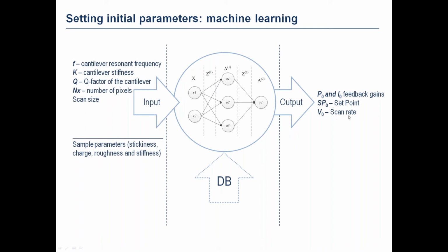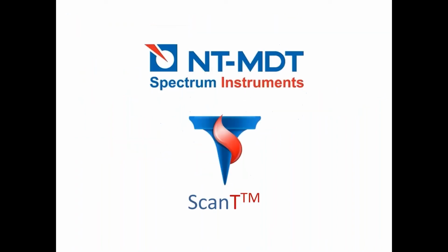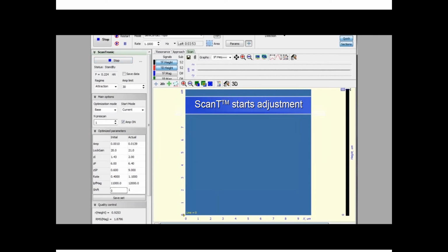Then the algorithm that is based on the linear optimization theory starts to operate with these initial settings. And this allows us to save the probe and to minimize the time required to adjust the optimal parameters.